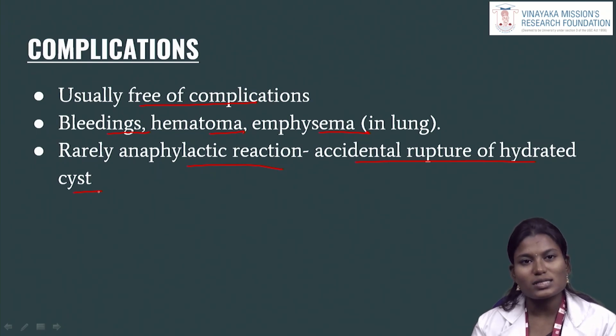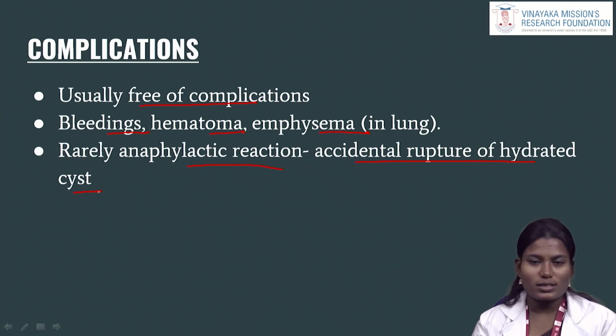Now we can briefly summarize how the sample is collected in the FNAC technique. First, FNAC cytology is the study of cells to detect abnormal cells inside lesions. There are three methods: FNAC without aspiration, with aspiration, and ultrasound-guided aspiration. Without aspiration is the capillary method. With aspiration uses negative pressure to collect the materials. Ultrasound is used to reach the correct lesion area and collect the samples.